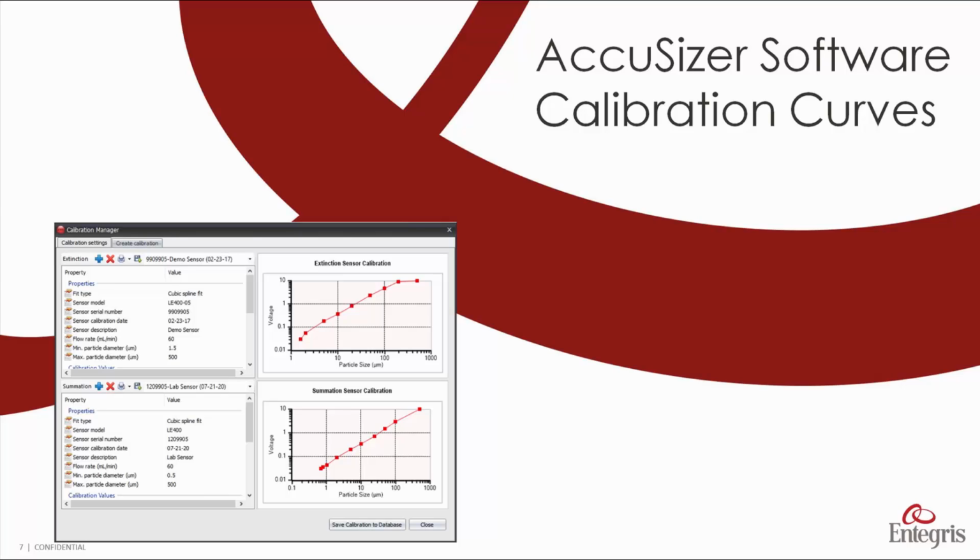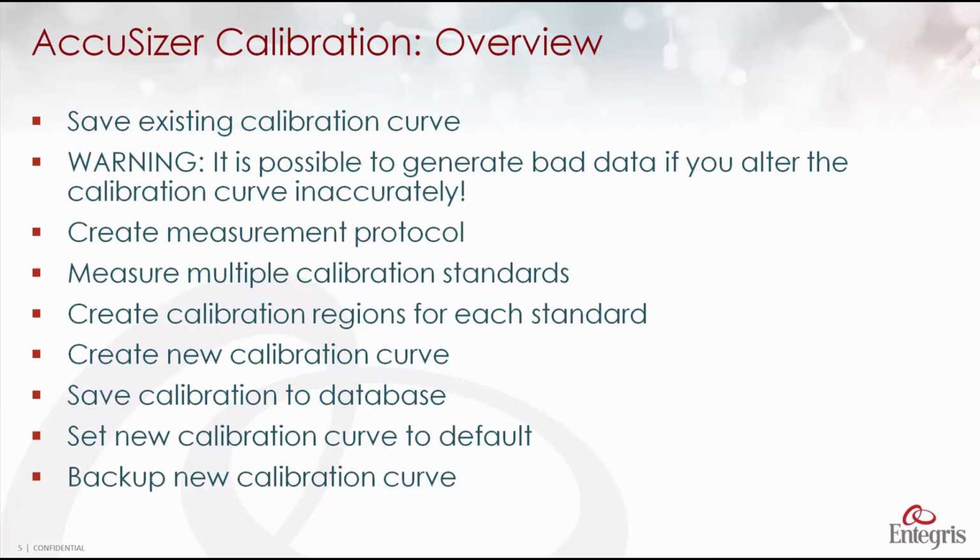This is AccuSizer software training on the topic of creating new calibration curves. Here is an overview to the process to create a new calibration curve.